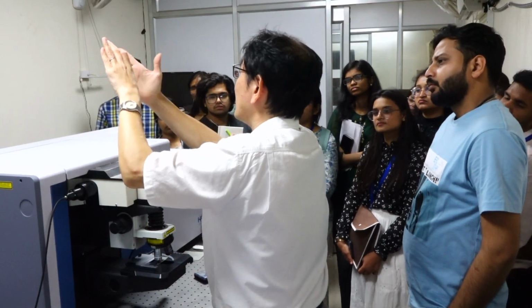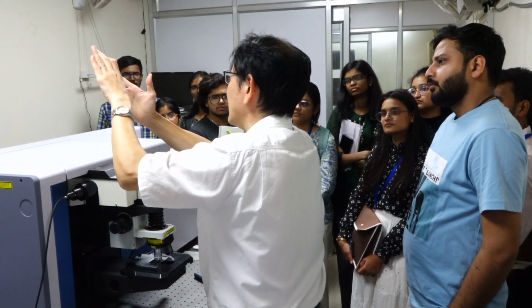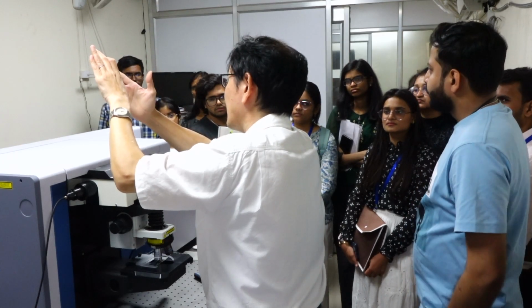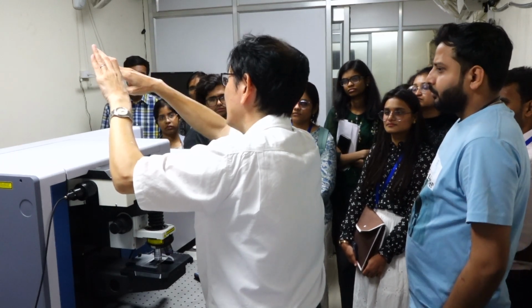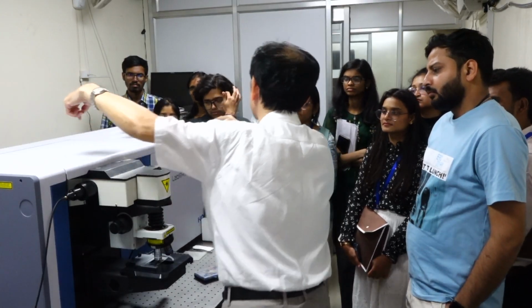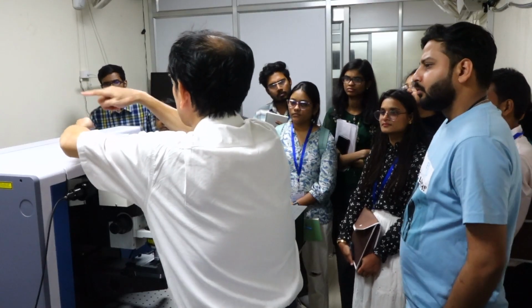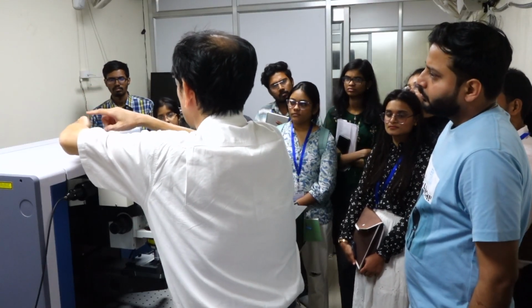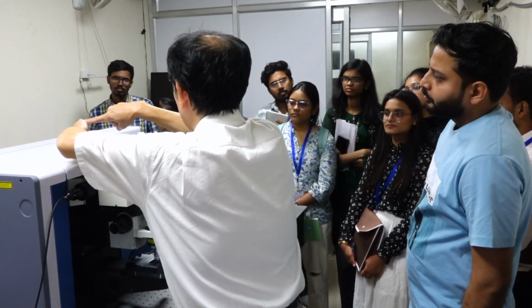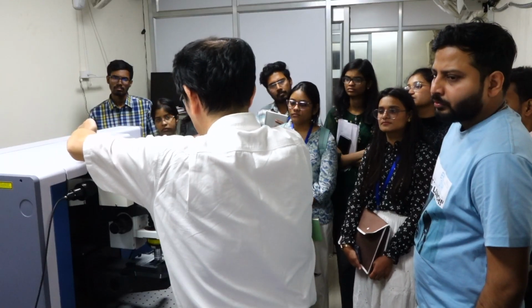So below, shorter than the cutoff wavelength, it is transparent, and above the cutoff wavelength, it's black. So when we use 633, this element transmits 633. Okay, so the laser line comes from that side and goes onto the sample.